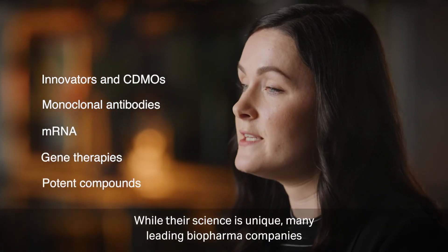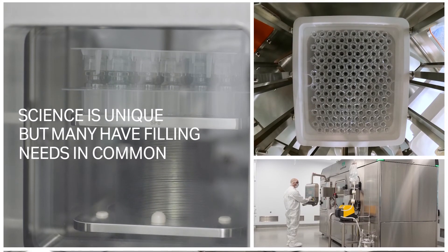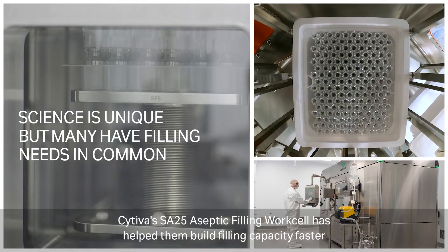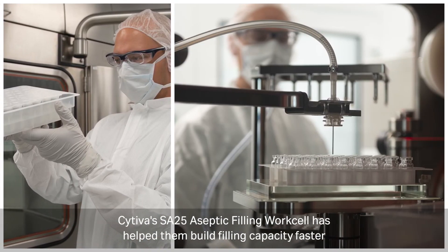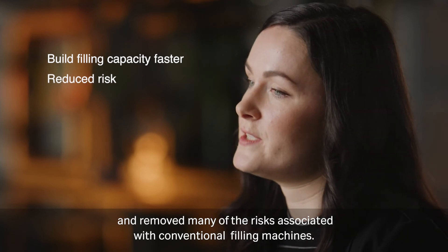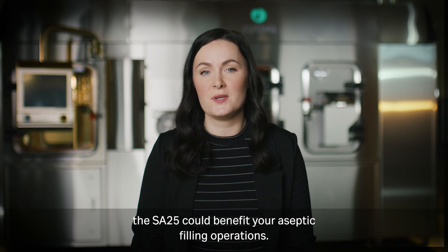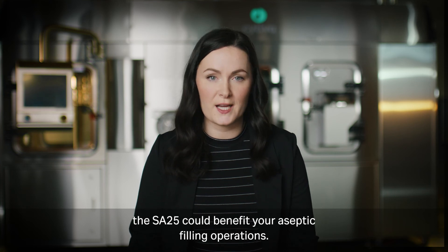While their science is unique, many leading biopharm companies have found that their filling needs have a lot in common. Cytiva's SA25 aseptic filling work cell has helped them build filling capacity faster and removed many of the risks associated with conventional filling machines. Get in touch with Cytiva today to talk about how the SA25 could benefit your aseptic filling operations.